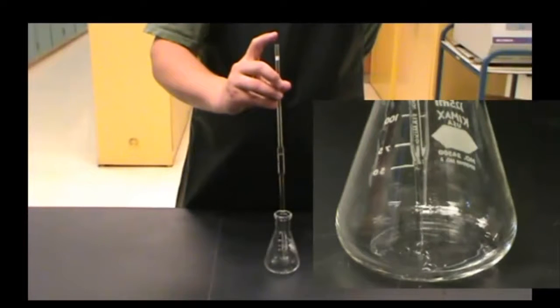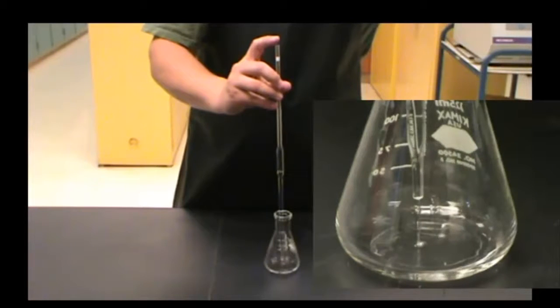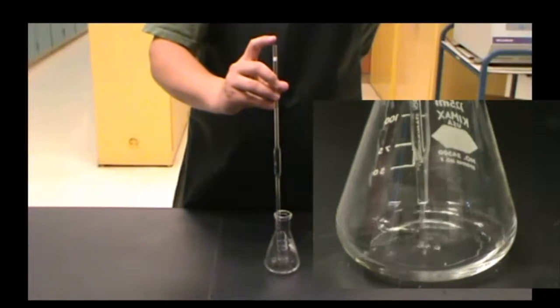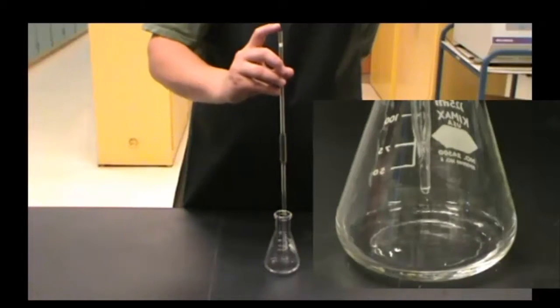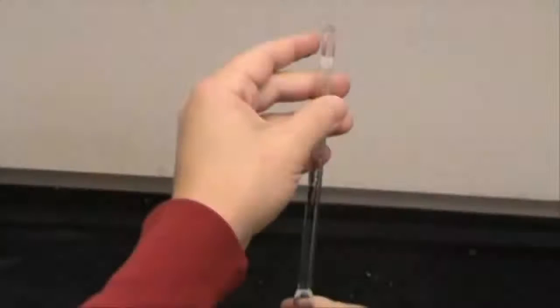After allowing all of the liquid to gravitationally dispense, you need to touch the tip of the pipette against the side. This makes the dispensing more accurate. Make sure you do not blow out the last drop. Remember, the TD notation means that whatever is dispensed is the correct amount. After practicing this a few times, you should be ready to do the acid.